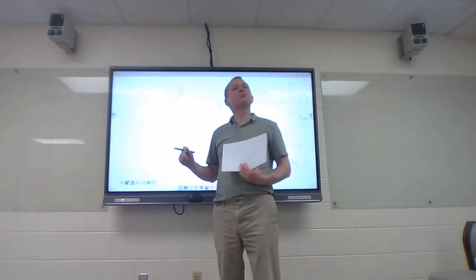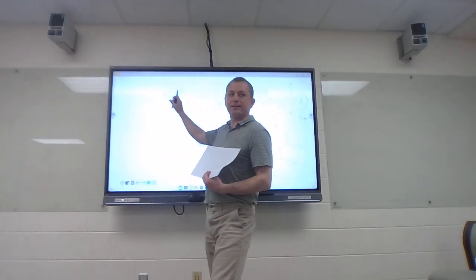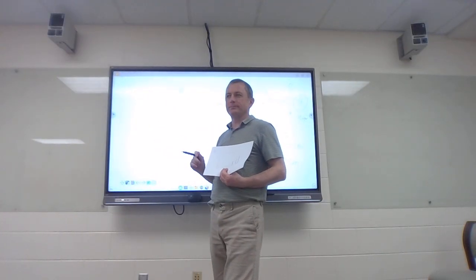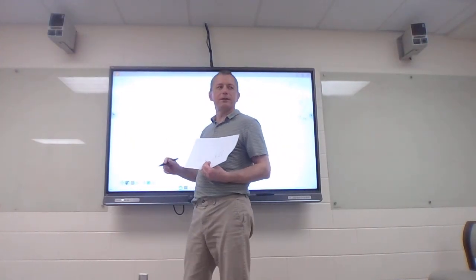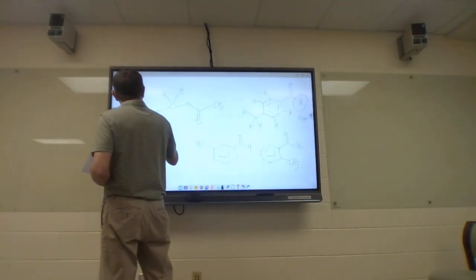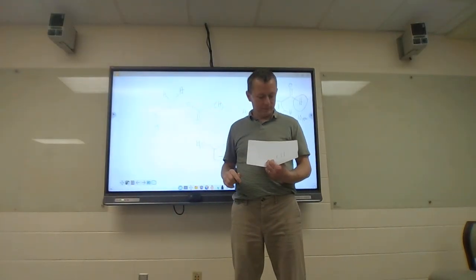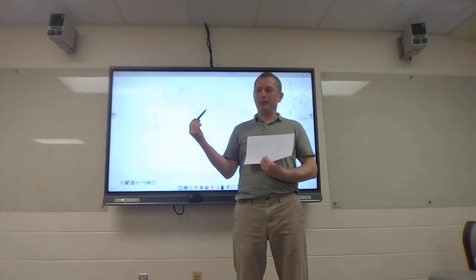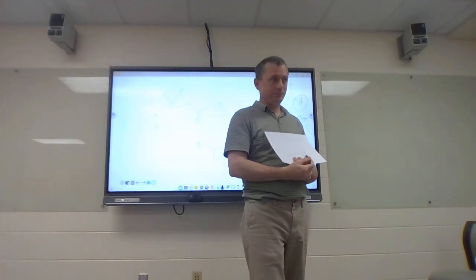Now let's try to figure out the rest of this. Notice this is split into how many peaks? 2. Meaning the next carbon over must have how many? Just 1. How do I get that? Let's look, and I'm cheating here. I'm looking at splitting and I really shouldn't. Look at the peak at around 1. What's its integration? 6. How do you get 6?